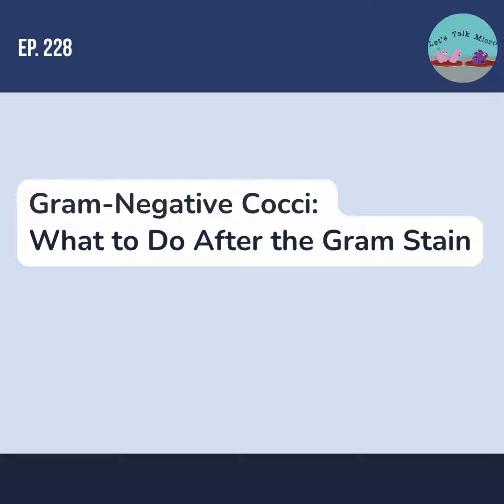And I said this in the last episode, but I invite you to do this in the lab. Go ahead and make a gram stain of Acinetobacter, one of Moraxella or Neisseria gonorrhoeae, and one of Haemophilus. Make those slides and then compare them and watch out for all the differences. Compare the size of a coccobacilli like Haemophilus, where you cannot tell what it is, to the kidney or coffee bean shape of the Neisseria, and those plump coccobacilli of Acinetobacter. I definitely invite you to do that.